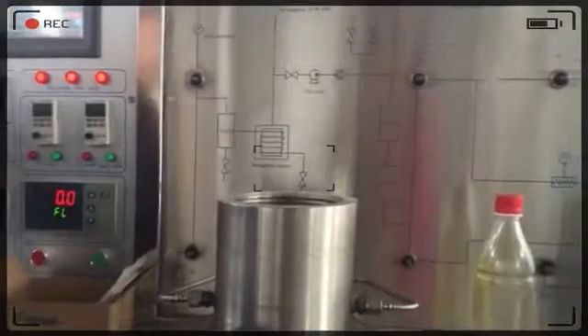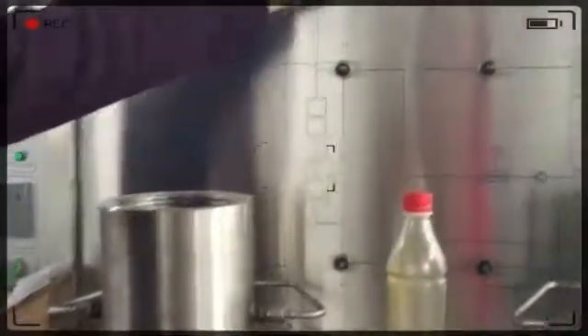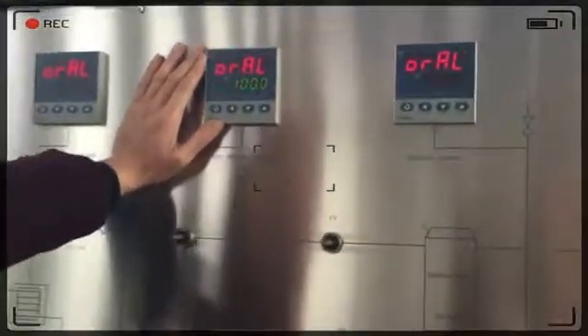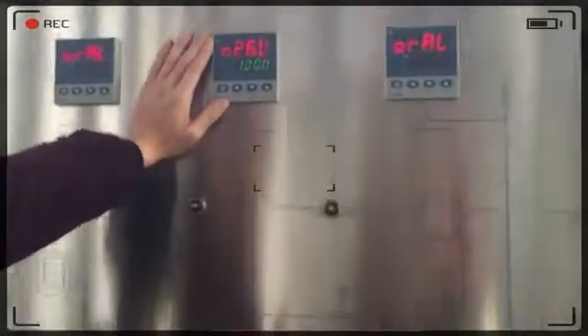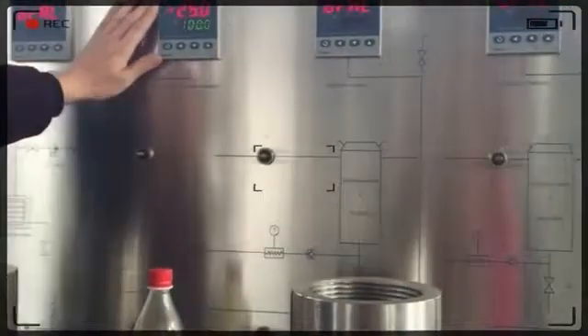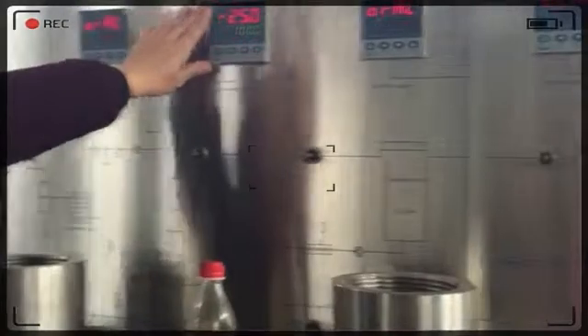We have safety valves on each part of the system. For the high pressure parts, we use double protection. If there are any mistakes in the operation, the machine will stop automatically.